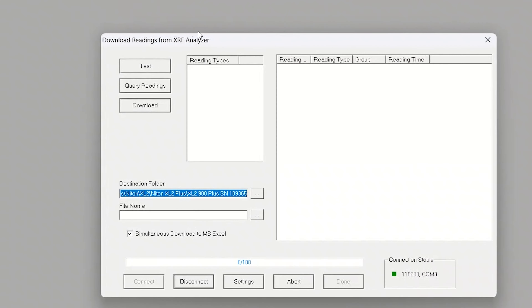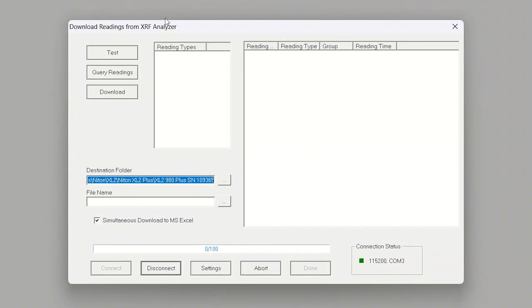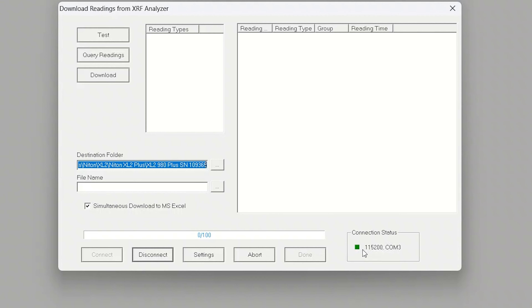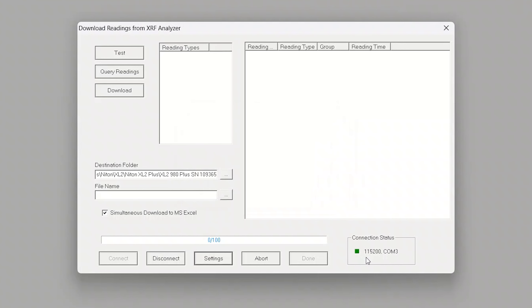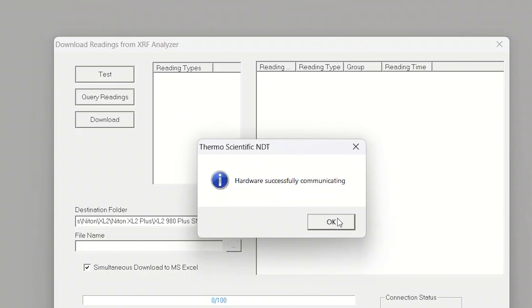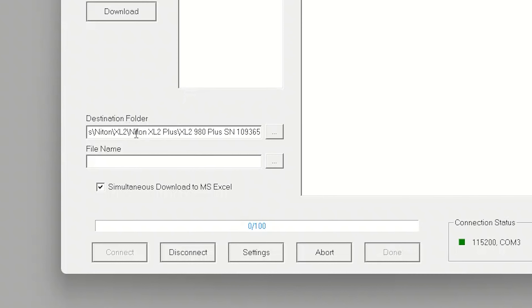If I double-click this icon it's going to open up the software package. I'm going to hit the download button here, and whatever you do, resist the temptation to click that download button — we're not ready yet. First, check down in the lower right-hand corner for connection status. That green symbol tells us we're connected. If this icon is red, click the settings button in the bottom center and make sure your COM port is selected from the dropdown. In my case it's already set and we have a green light. You can also hit that test button — it'll confirm hardware is successfully communicating.